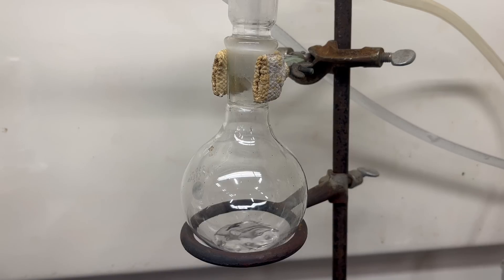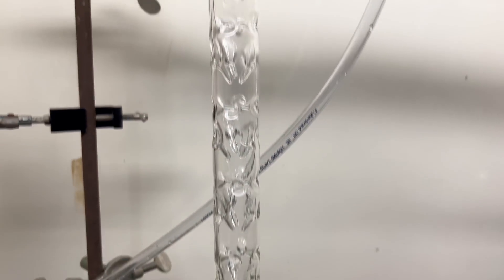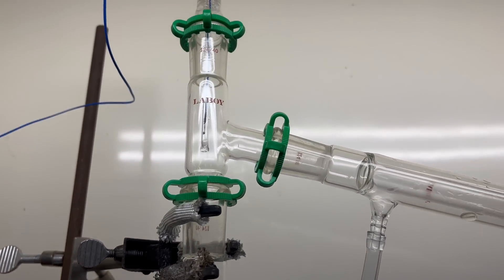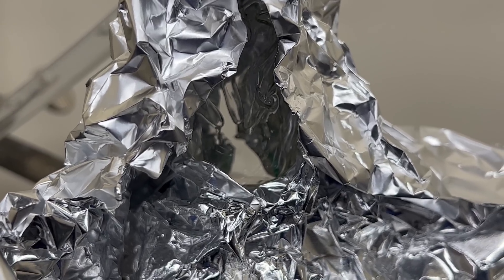The fractional distillation setup is quite similar to a regular distillation. The only difference is the inclusion of a fractional column. This allows a place for the vapor to condense, leading to better separation of the mixture.